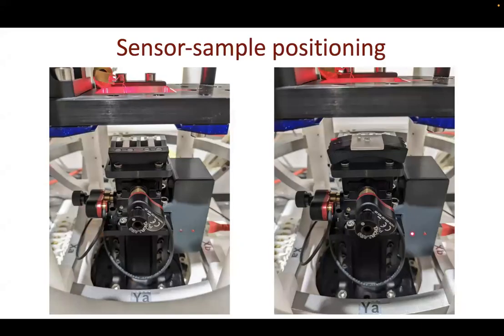Then there is the sensor sample positioning. Previously, these things were usually done by hand using a couple of actuators, but that was not precise enough. And we always dreaded breaking the diamond. These diamonds are almost the most expensive part, so we didn't want to turn knobs underneath it. So that was when our technician came up with James. We call this thing James. I know why, but it's a Dutch acronym, and it was born out of frustration, so I'm not going to repeat it here.